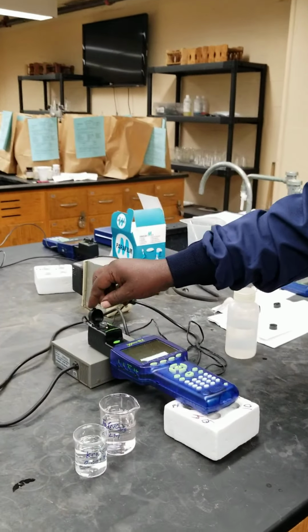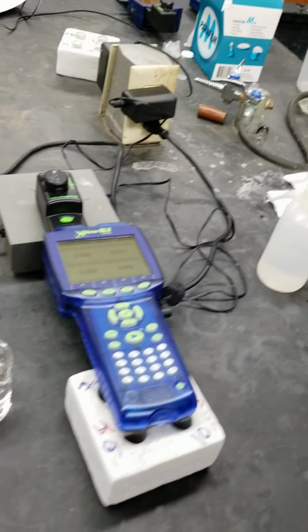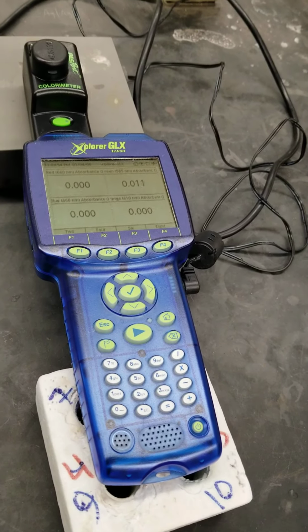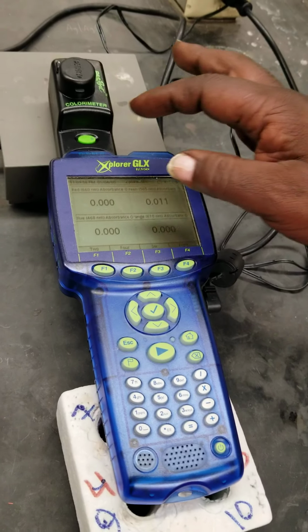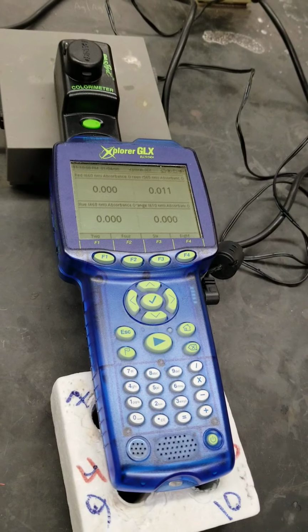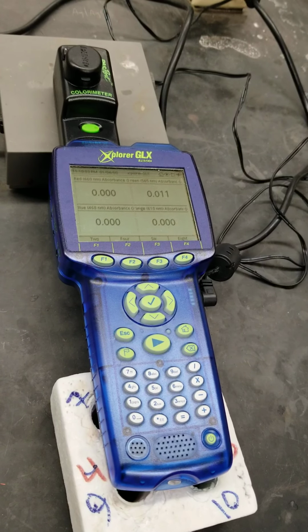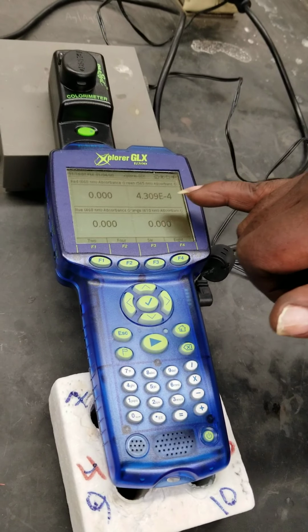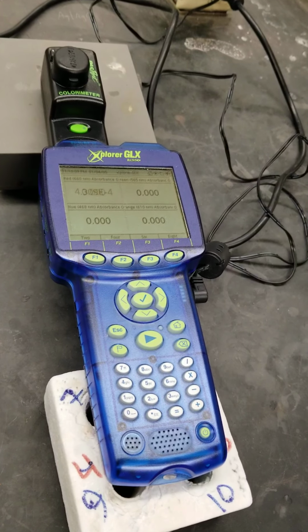Now we've got to tell the instrument that this is our solvent. Please read this as 0. We do that by pressing this little button here. And then it goes, I'm considering this as 0. There might be a little residue there, but all 4 wavelengths add up as 0.